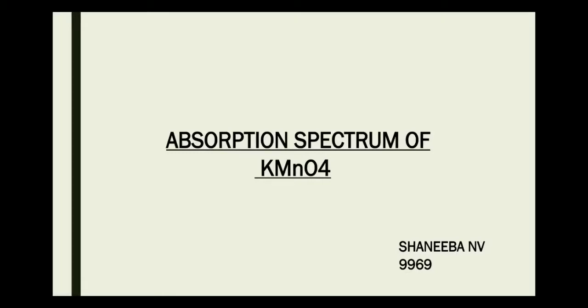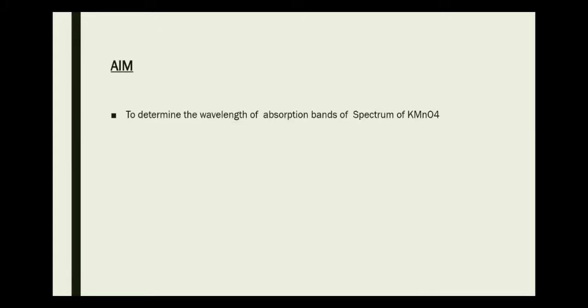Hi all, here we discuss the experiment absorption spectrum of KMnO4. The aim of the experiment is to determine the wavelength of absorption bands of the spectrum of KMnO4.